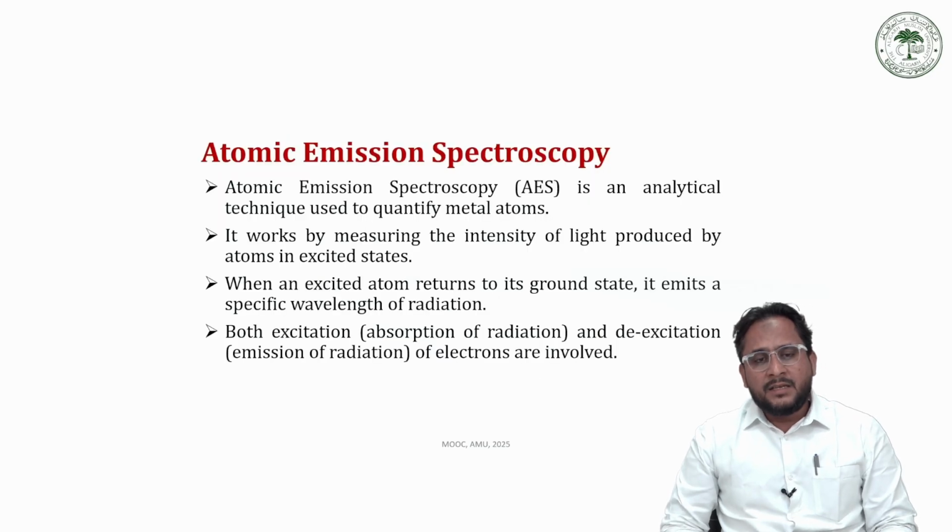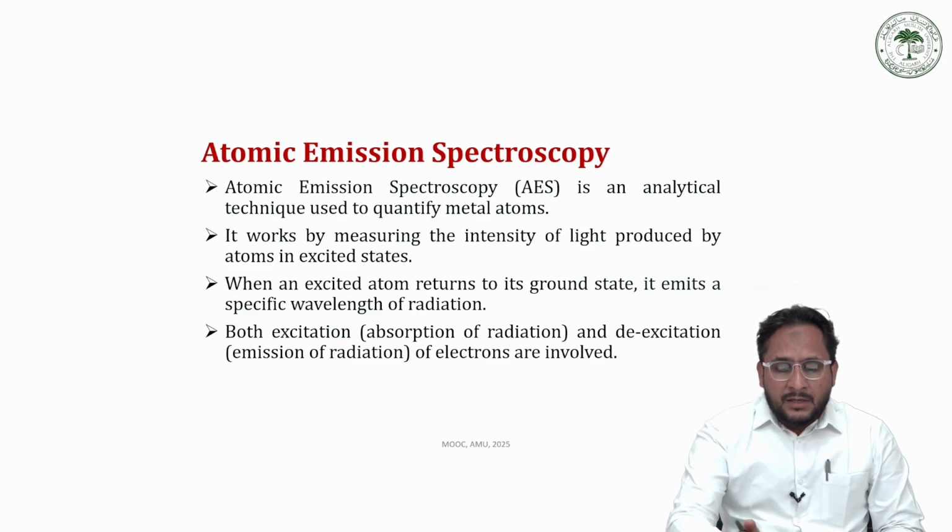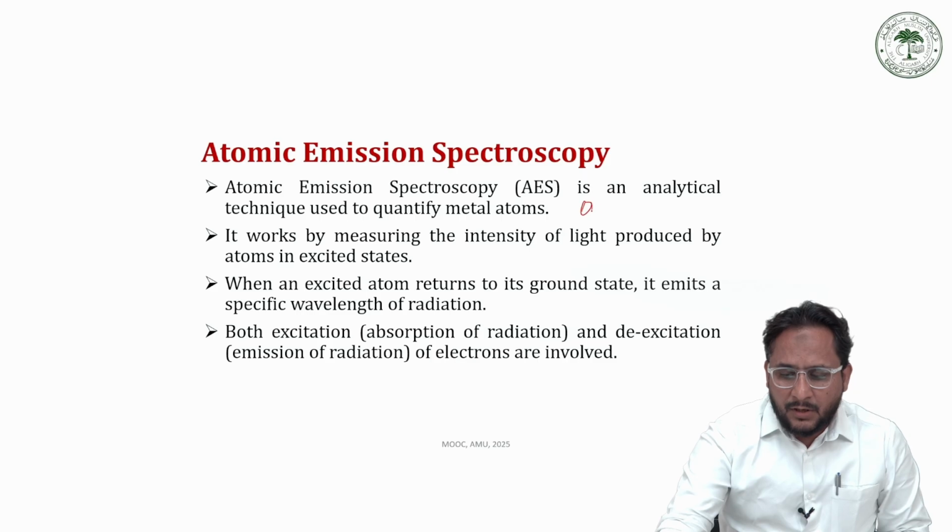So, as I said, atomic emission spectroscopy is another interesting and very useful analytical technique that is used for the qualitative as well as quantitative analysis of metals, ranging from alkali and alkaline earth metals to transition metals, certain metalloids, lanthanides as well as actinides. This technique is also known as optical emission spectroscopy.